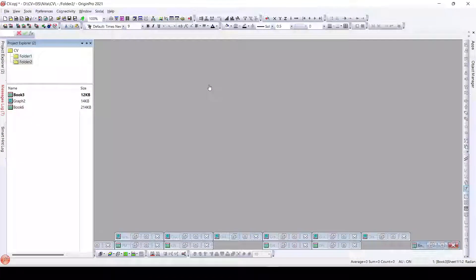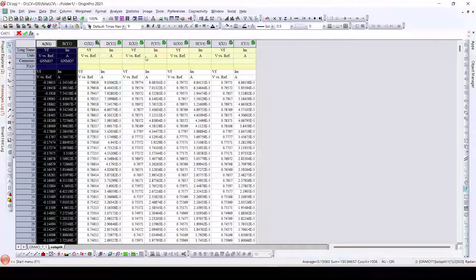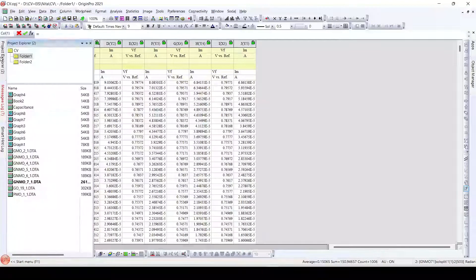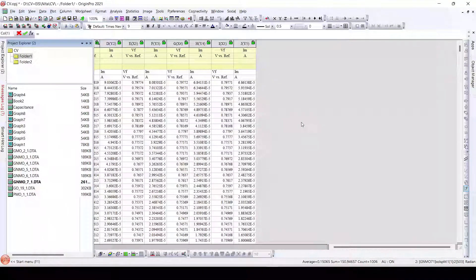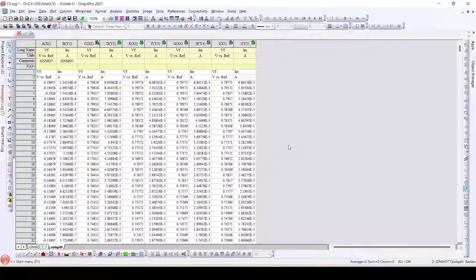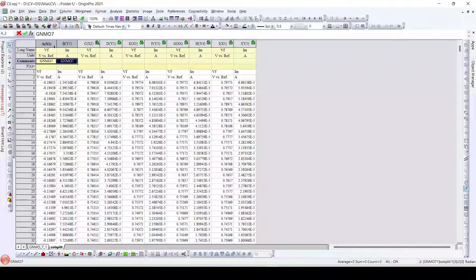Here the columns that are present — we will use the first two columns that need to be added. As we can see in the project explorer there are different datasets, and from each dataset or from different books we will use the first two columns of the first worksheet, which is called split. In order to identify the worksheets that need to be added, I have added comments to these worksheets indicating the columns that need to be added.